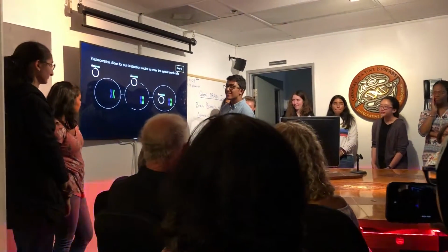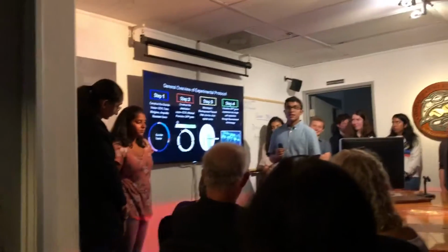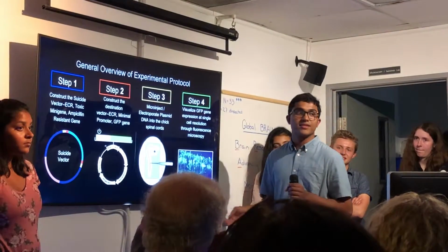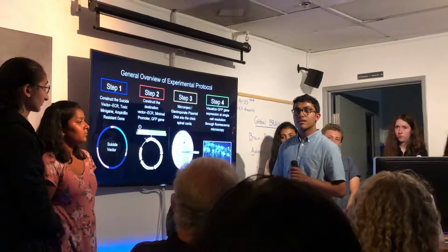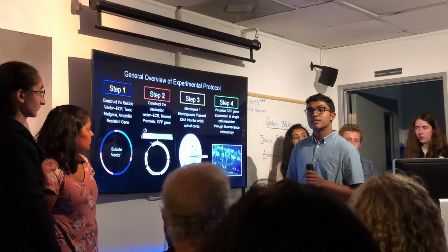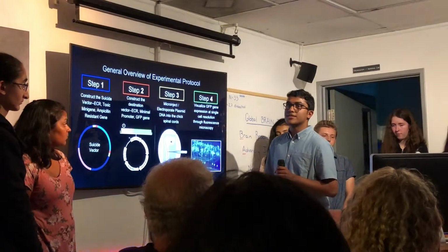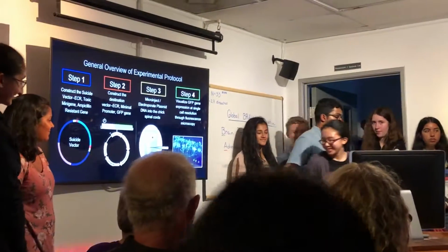Based on some of the conversations we had, Vic, you may have mentioned this already. Go ahead, you can go to your next slide. In how many cells, theoretically, should the plasmid be introduced? The plasmid should be introduced into all of the cells nearest the positive electrode. Okay, and what would flip the switch on that plasmid and drive GFP expression? Transcription factors. Okay, in every cell? Not in every cell, and only the cells in which the transcription factors are present. Great, okay. I'm sure Leanna may want to go there again.